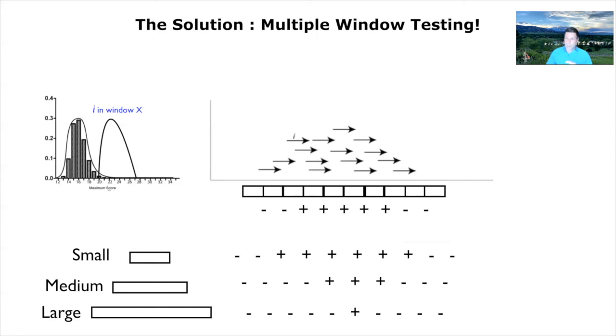But for now, just know that you're going to get broad peak and narrow peak files back out from Nextflow. And that's kind of this concept here where it ran a narrow window to see where the sharp peaks were and a broad window to find where the broad peaks were.